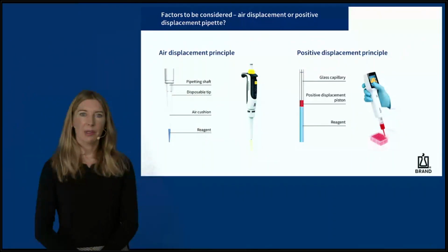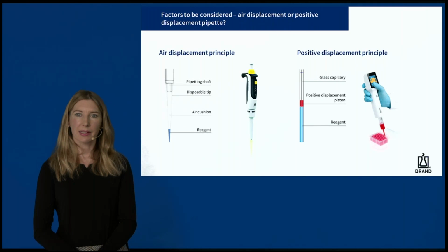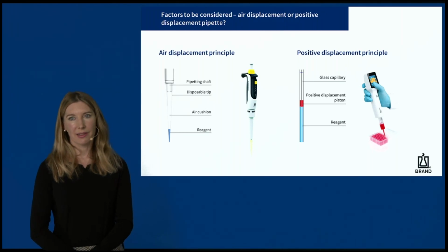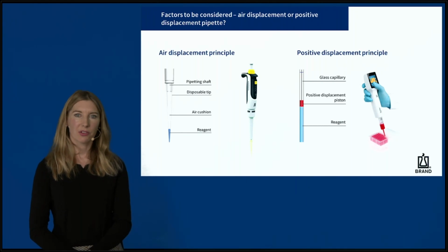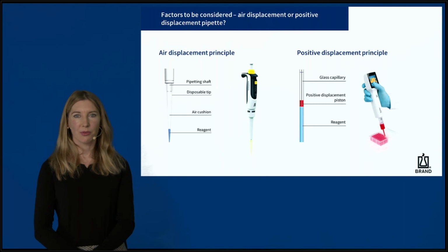This enables contamination-free yet simple handling with the highest precision. But this is also where the application limits of the system lie. Media that strongly influence the air cushion can affect the accuracy of the result. For example, foaming liquids like detergents, as we already mentioned before, make precise work difficult.